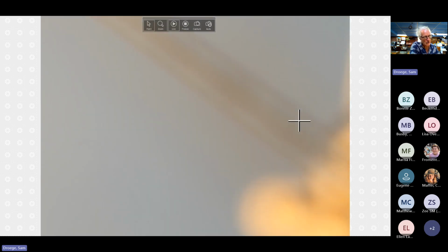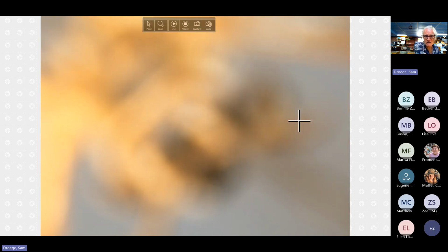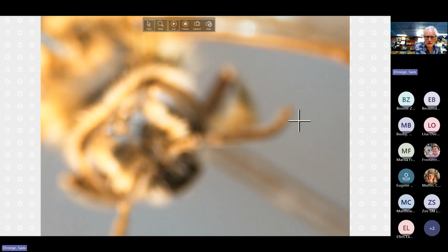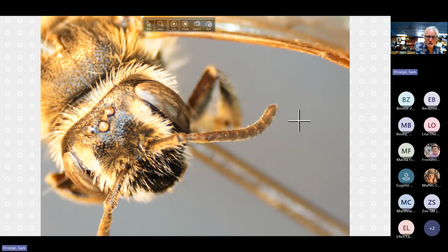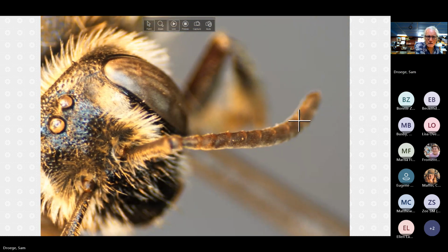Let's flip to the face and see another relatively good character for the group. And this is for Bessii, yep. And the important thing here is, what is the important thing? Is we're looking at these as general characteristics. And so if I can move in here a little bit, I think this is visible. We'll look at the other side too here.